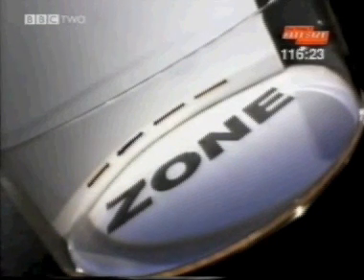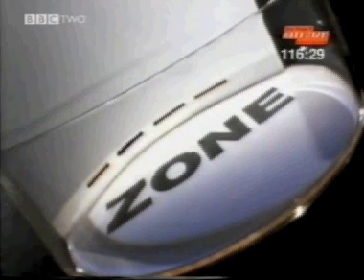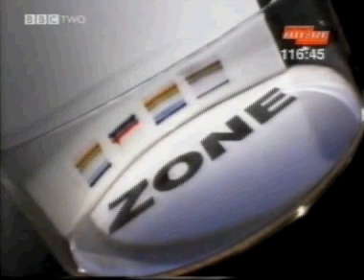The dish contains a small amount of chemical in the form of a liquid that will dissolve the ink. By leaving the paper to stand in the dish, the liquid will gradually soak into it and move upwards. The liquid causes the dyes in the ink to move with it up the paper. As some dyes move faster than others, they'll start to separate from each other showing the different colours contained in the ink.